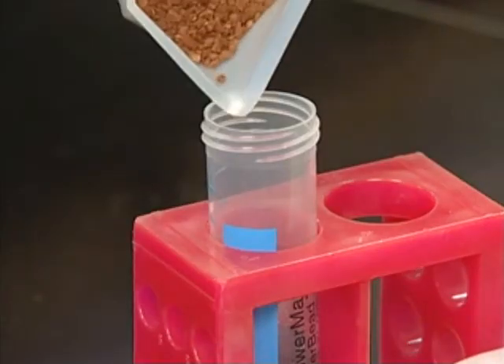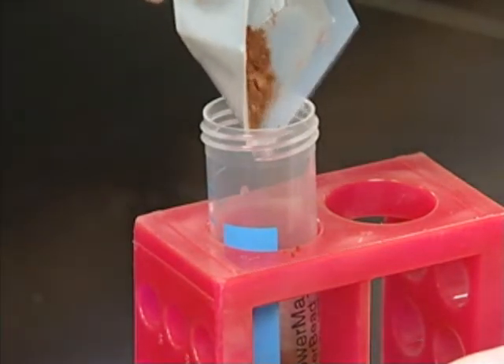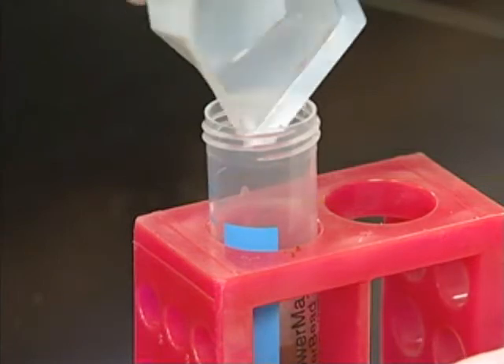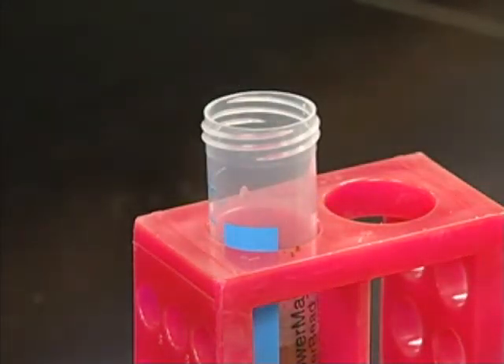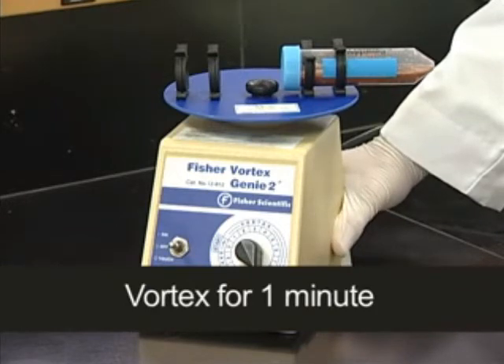The soil sample is now added to the tube with the solution in it. Next, we vortex the tube on a mechanical vortex like this one for approximately one minute.